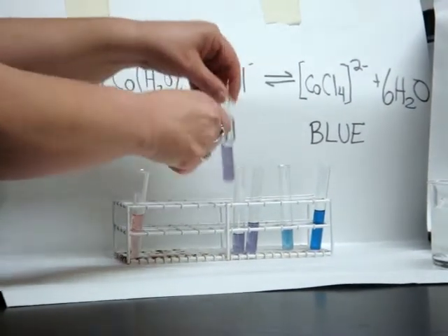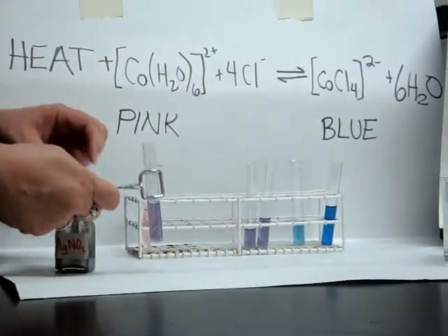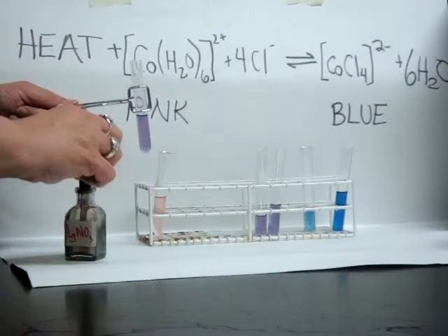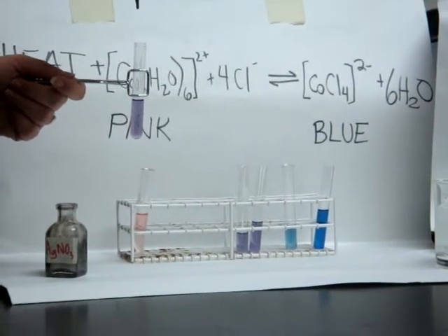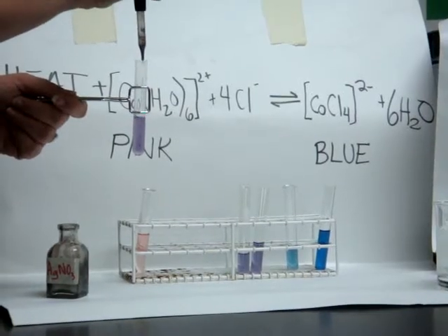Let's try something else now. I have some silver nitrate, AgNO3. I'm going to add some of that. Which way do you think it's going to shift? Left. Why? Let's see if you're right.